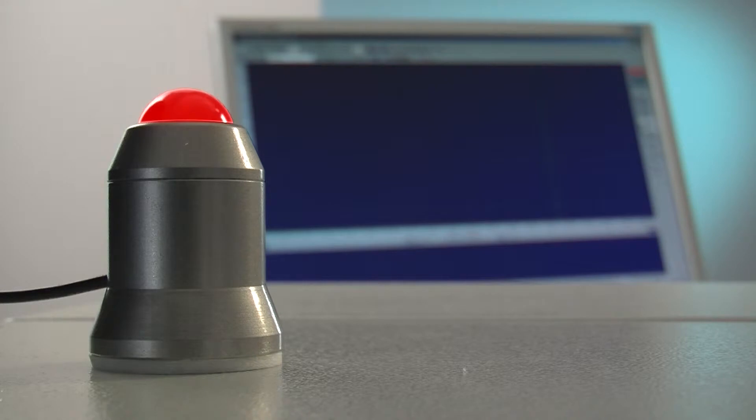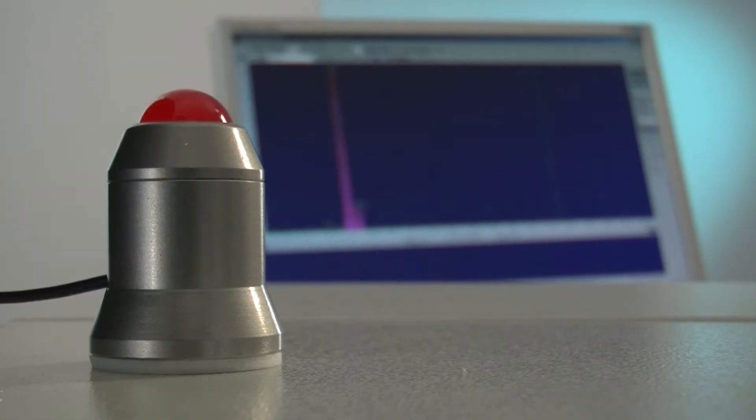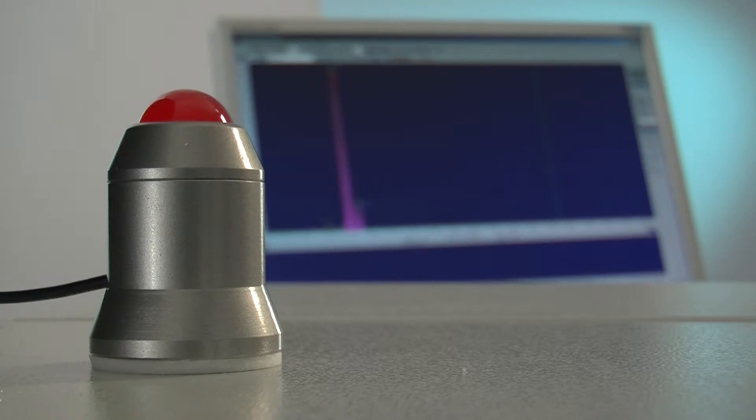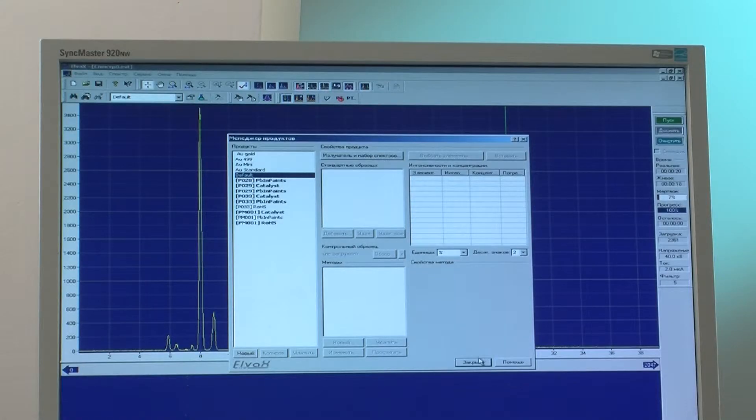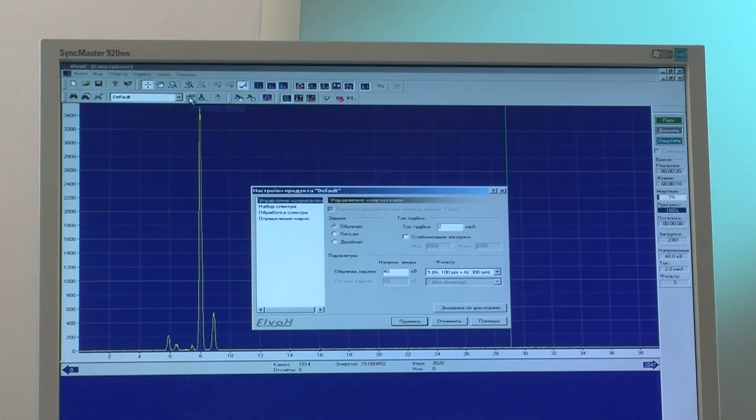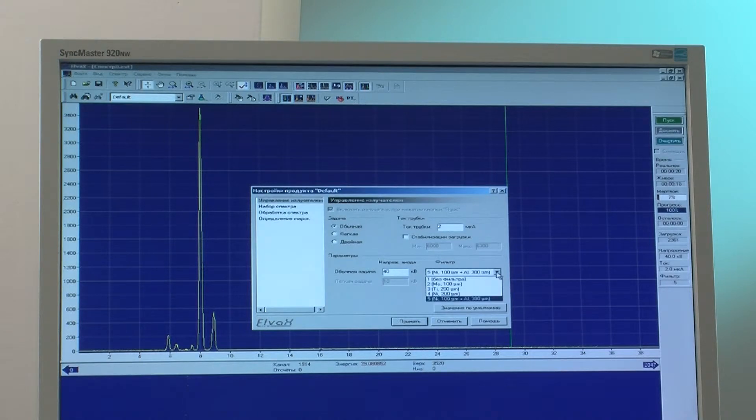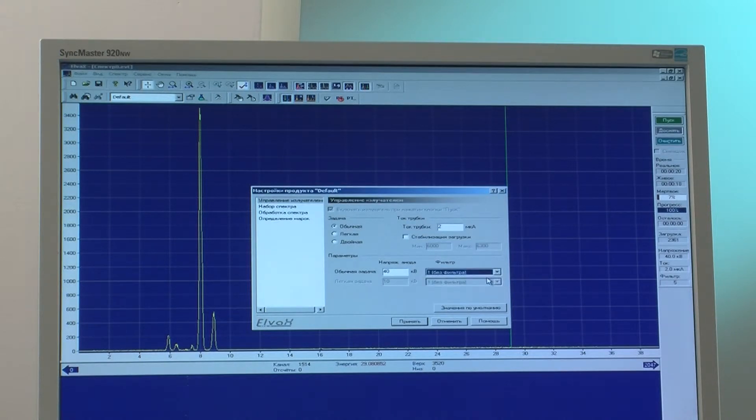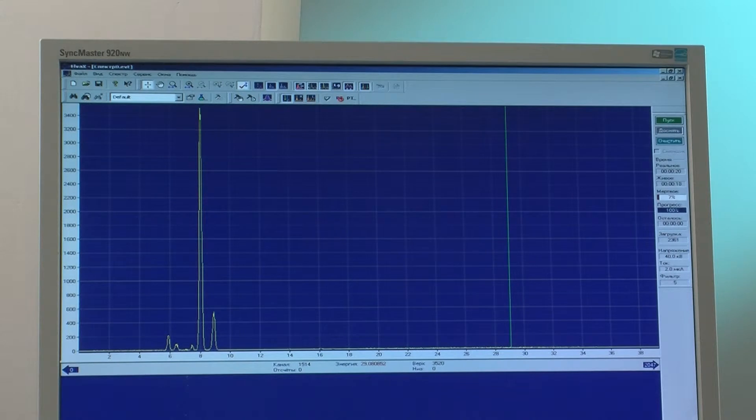After the first seconds of measurement provisional results are shown, which are refined through to the end of the measurement. The elemental chemistry of a sample is determined in a matter of minutes or even seconds and is available on a spectrum diagram for further in-depth study if necessary.